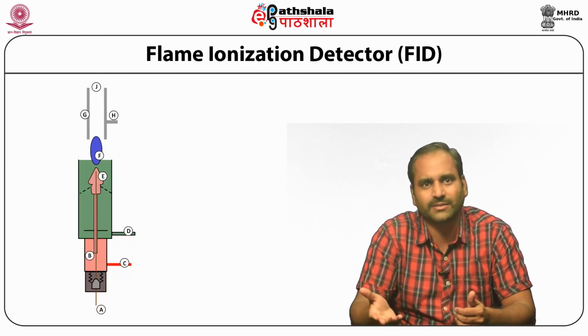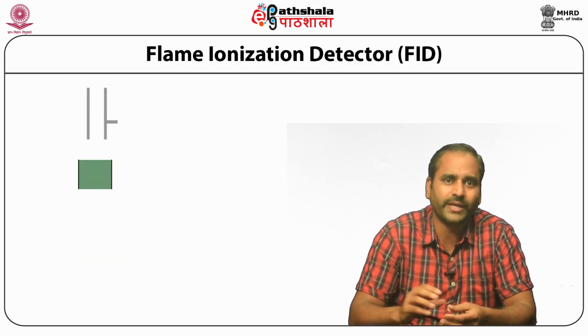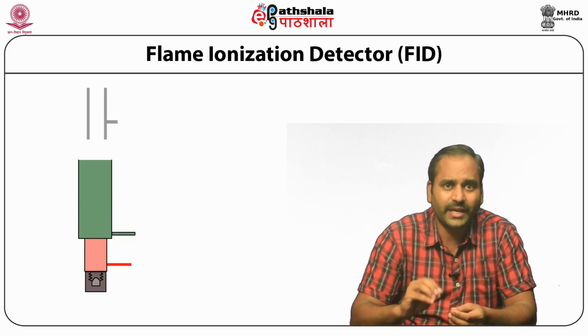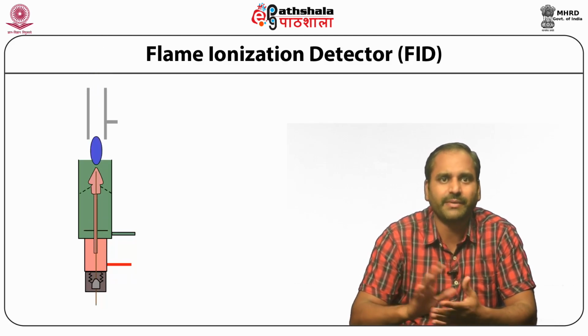and display system. The products of the flame are finally vented out of the detector through an exhaust port, which is designated as J. An excess flow of air is required to ensure complete combustion, unit carbon response, and the widest linear dynamic range.